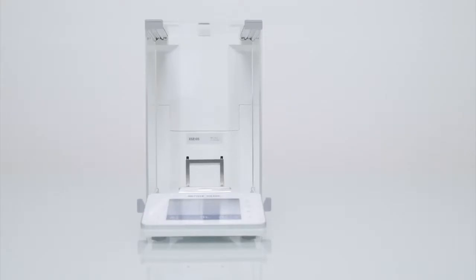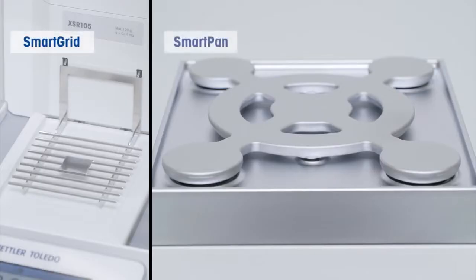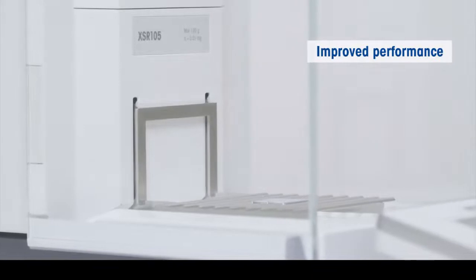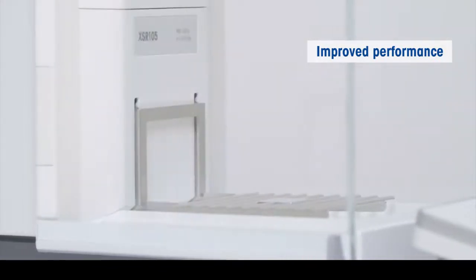An important part of the balance is its weighing chamber and the smart weighing pan. The so-called smart grid or smart pan are designed to maximize performance by reducing the surface area of the weighing pan and at the same time optimize convenience during weighing.